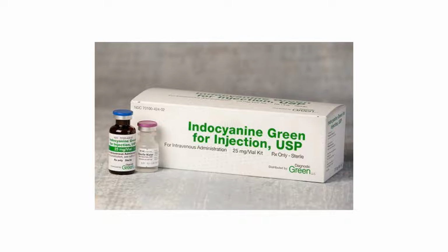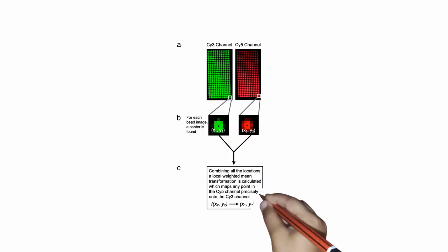Your aim is to visualize this in the internal organs, how that particular thing is going in the circulation, and then in which organs it is getting deposited, and for how long. You can do the imaging at time intervals, for example 4 hour, 8 hour, 12 hour. Cyanin 3 and cyanin 5 channel dyes you can use if you want to target some nanoparticles to the brain or any other organ.